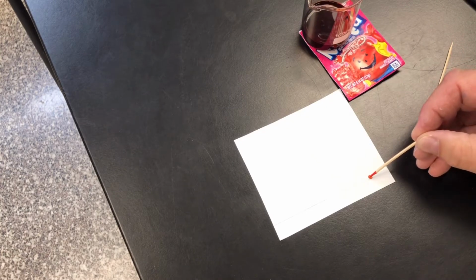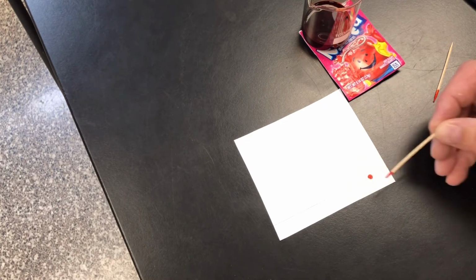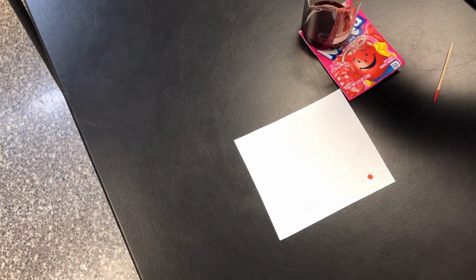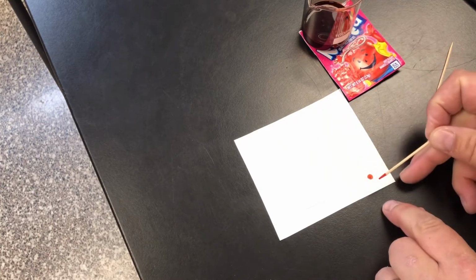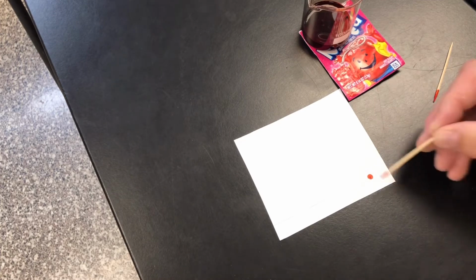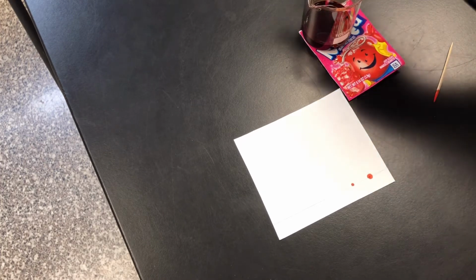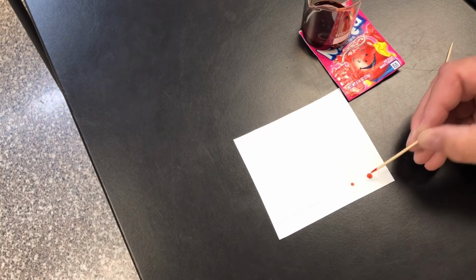And then if you were to allow that to dry, we'll let it dry, because if you dip it and it's still wet, it's going to expand. So what you don't want to do is let that expand too much, especially if it gets down here where the water is, it's going to go into the water and make a mess. So we would let that dry and then come back over the top of it. Okay, I don't know if it's dry yet or not.